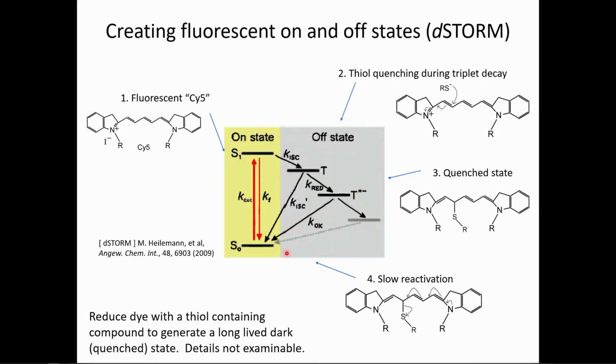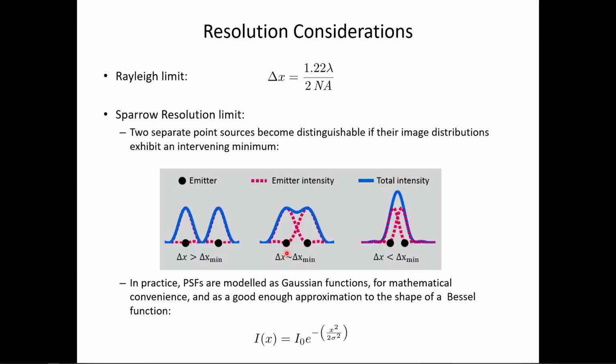So you can actually control a little bit how much you're putting back. If the rate is too low and none of the molecules are on, you may add a bit of oxidizer, change the reducing buffer a little bit, so that you can control the stochastic rate at which the molecule can come off and on. And that's the idea behind it.